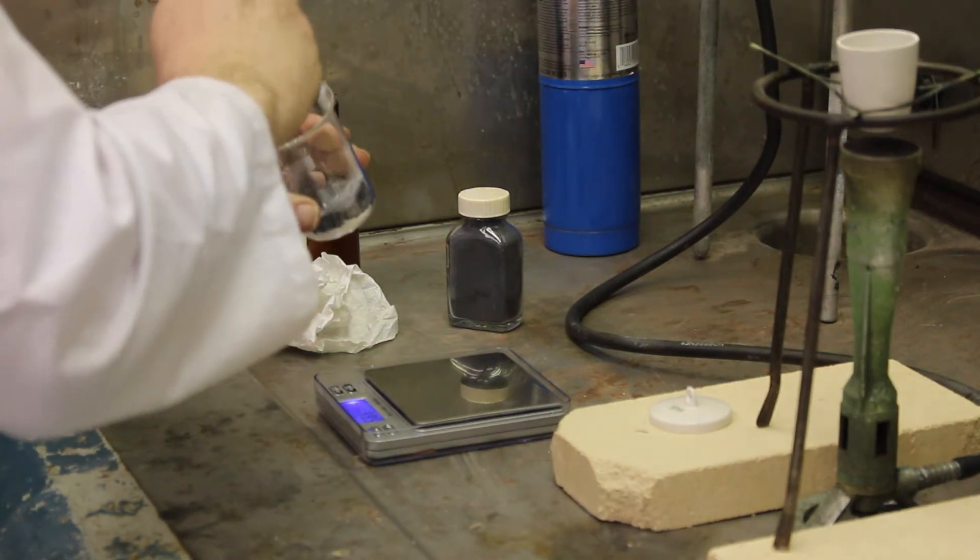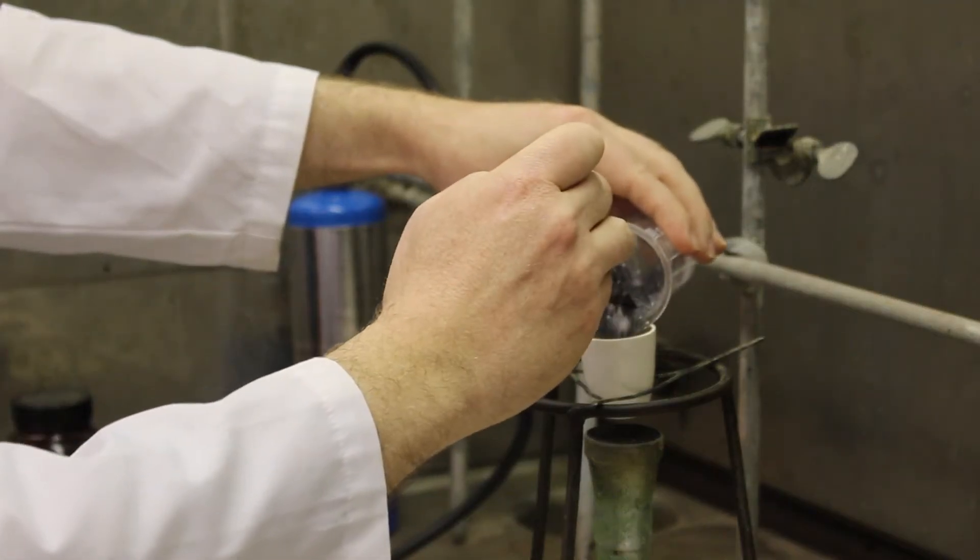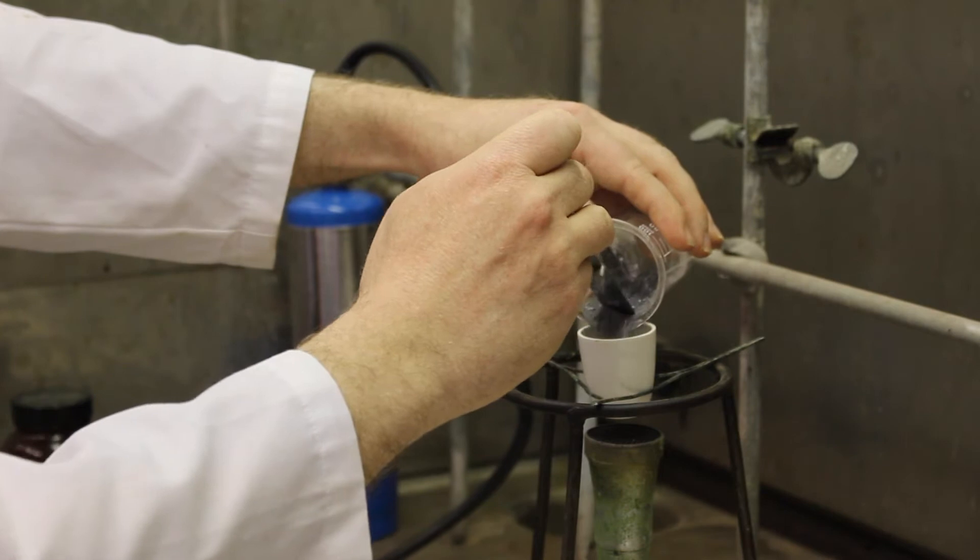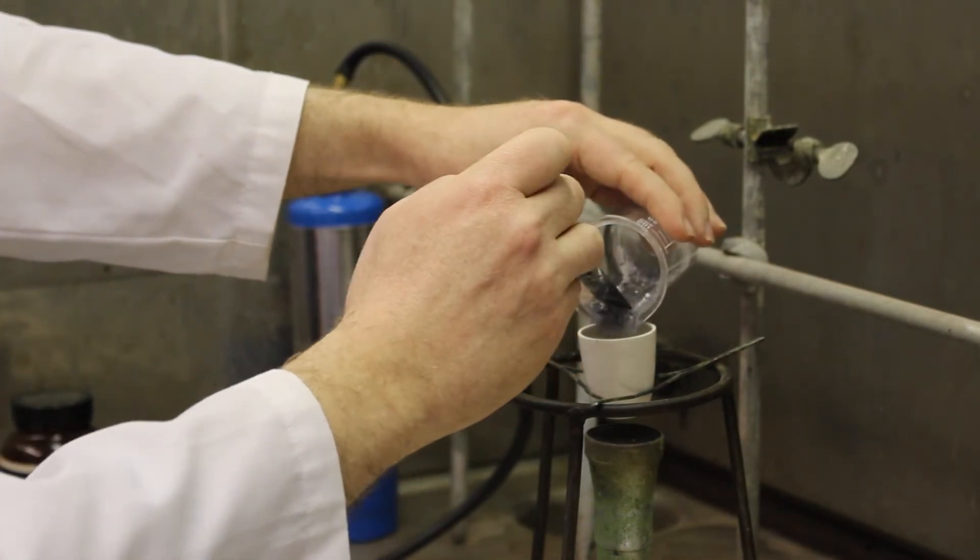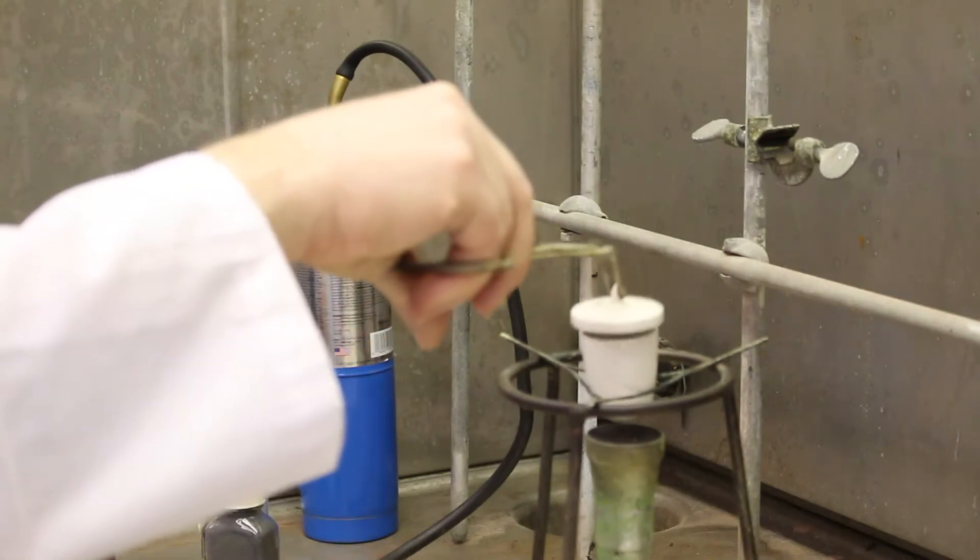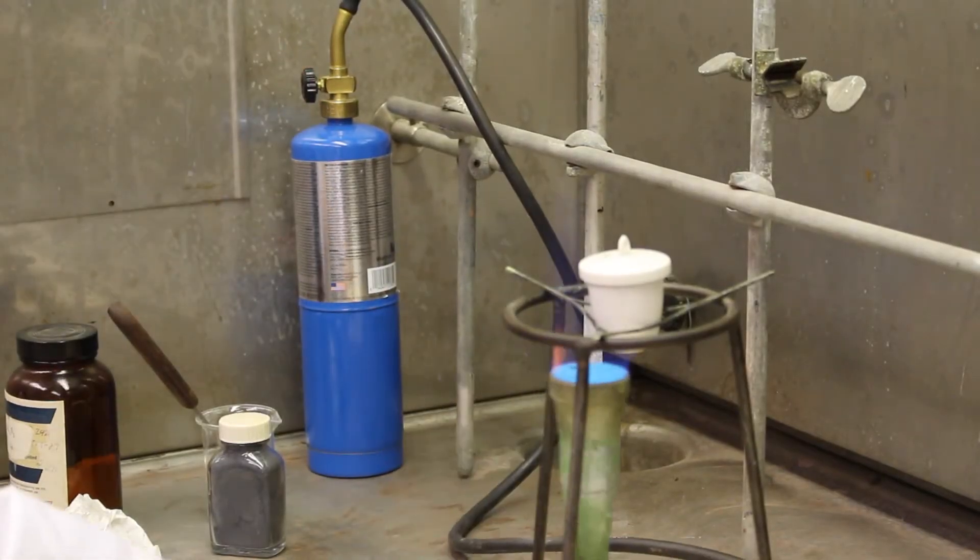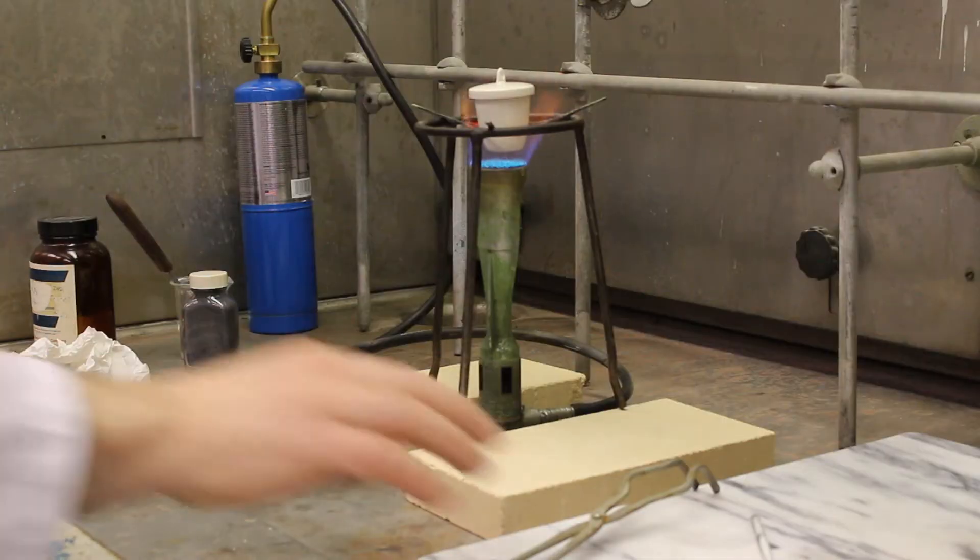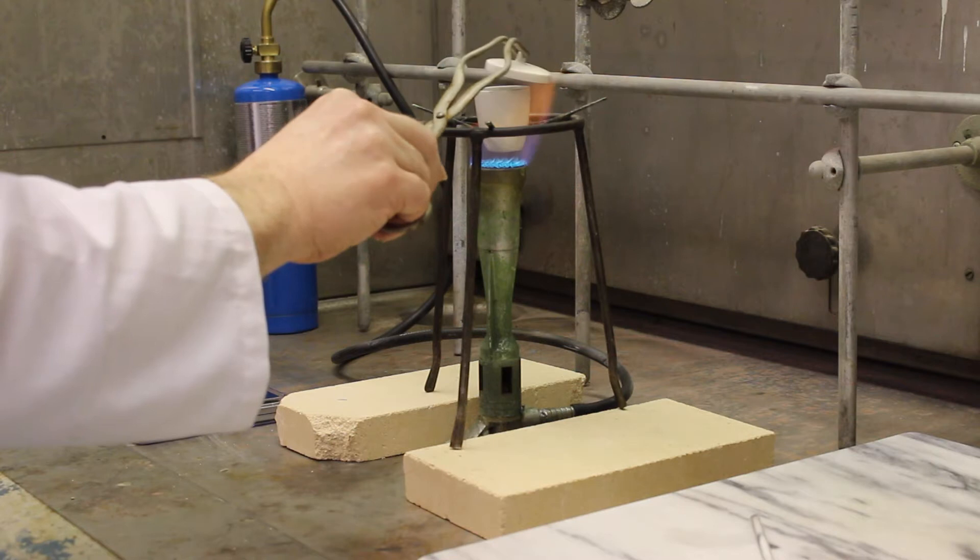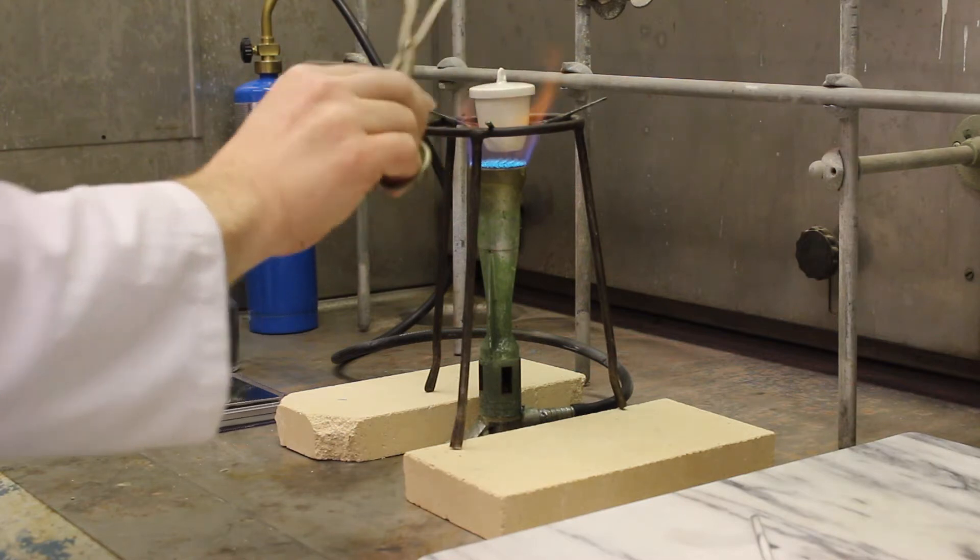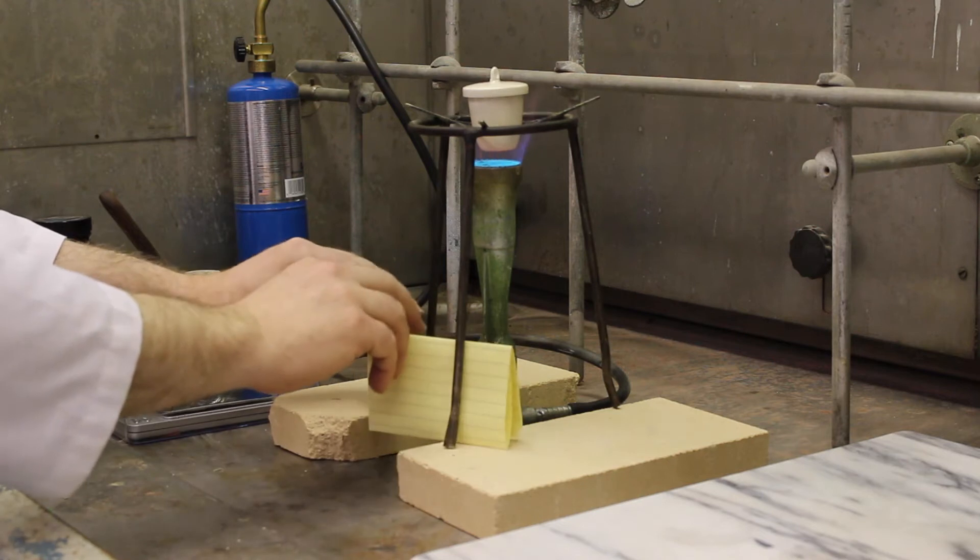The problem is that there are so many variables, it's really a difficult process. And one has to understand that certainly 90% of the things you try are going to fail in one way or another. And it's going to take a huge amount of patience actually to work through the processes to, for sometimes, stop thinking like a chemist and think like a 17th century alchemist. What would a 17th century alchemist do? Not what would I do as a 21st century chemist.